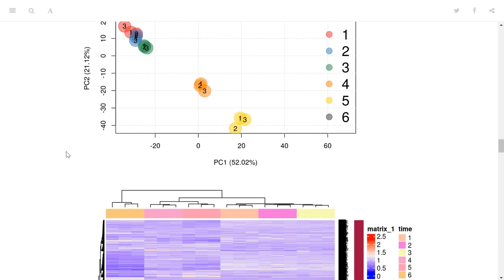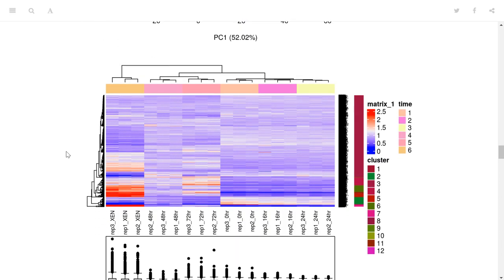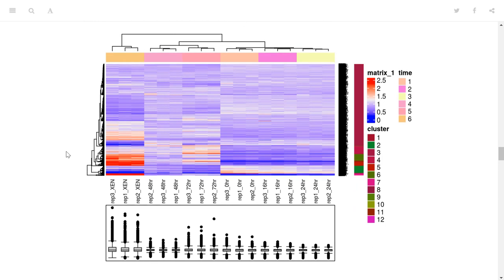Same data set here, Mol Vi, where we create a heat map with the clustering of our samples at the top, clustering of our features, the proteins, on the side, with some color codes to reveal different time points, and here's some k-means clustering, and we'll do that together to identify some structure in the features.